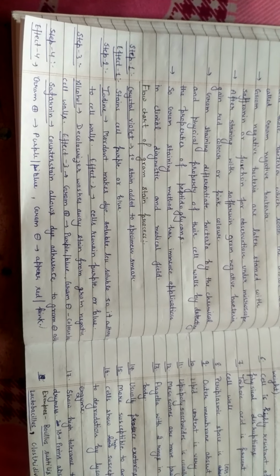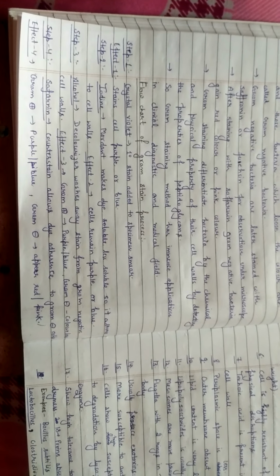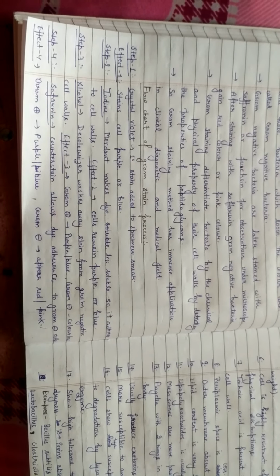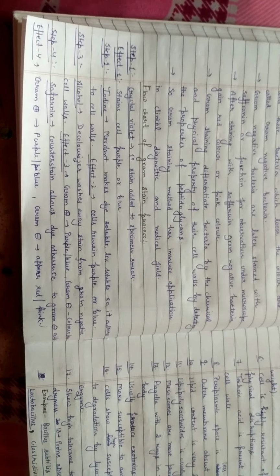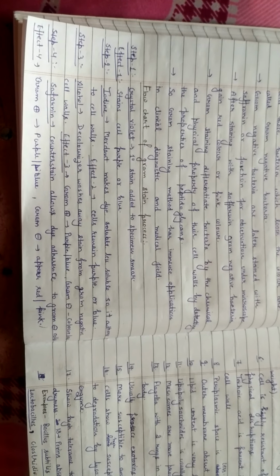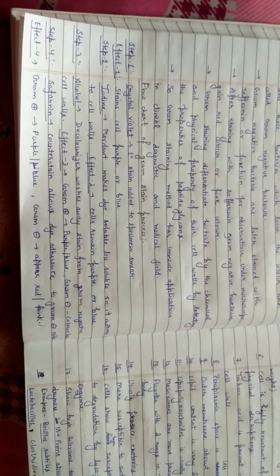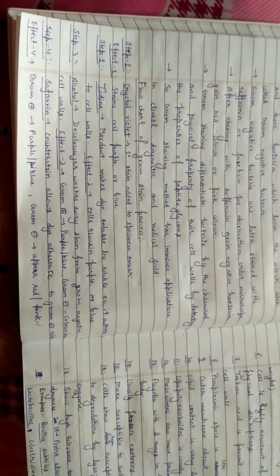After iodine treatment, he treated both the bacterial species with alcohol. Alcohol acts as a destaining solution, or we can say a decolorizer solution. So alcohol washes away the purple or bluish color which was gained by both the bacterial species.